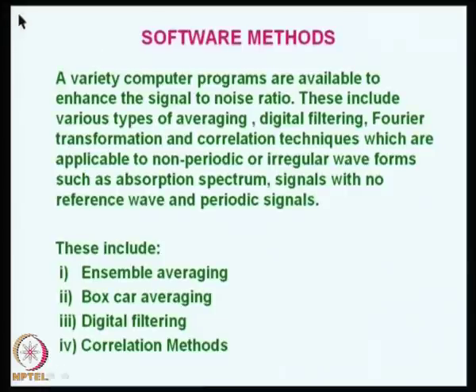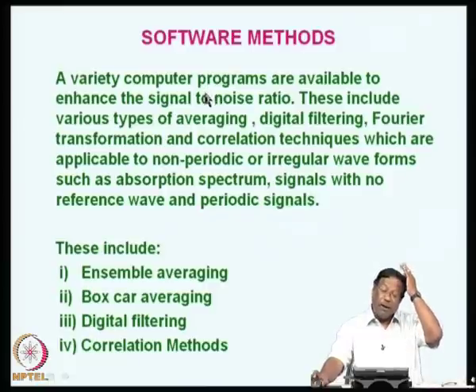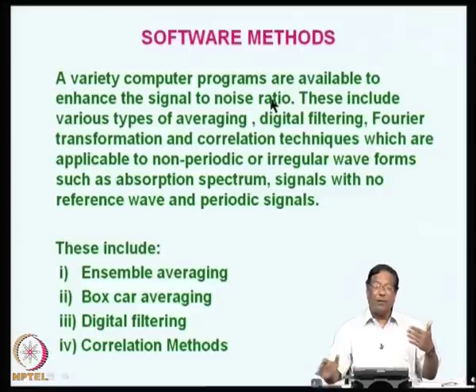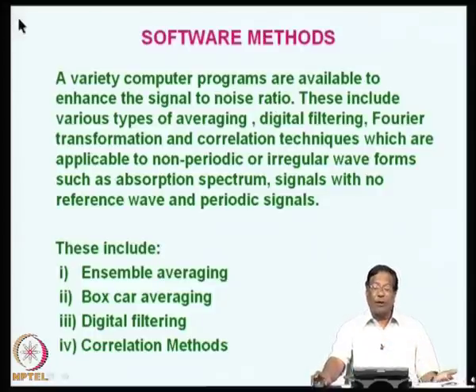Now, there are several possibilities. A variety of computer programs are available to enhance the signal to noise ratio. This is important because the signal determines the basic value of the absorbance that you are going to measure, because less than that you will not be able to attain at all.